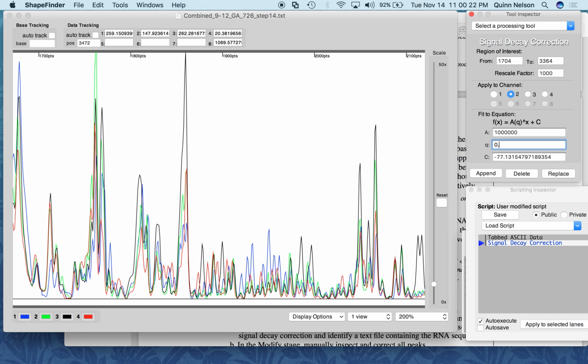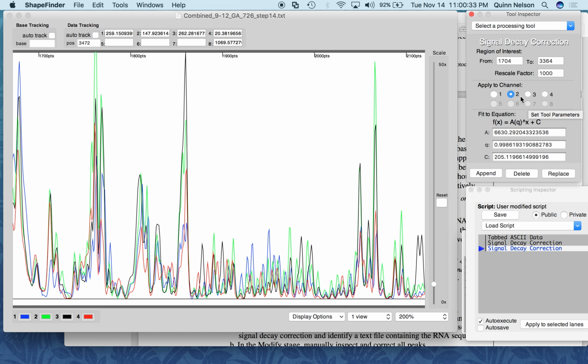Q, 0.999, 3 nines. C is 10,000, 1 with 4 zeros, 1, 2, 3, 4. Append. Okay, channel 2 changed. Channel 3, make sure to click that, million, 6 zeros, 1, 2, 3, 4, 5, 6.